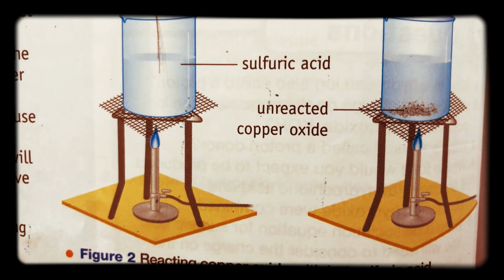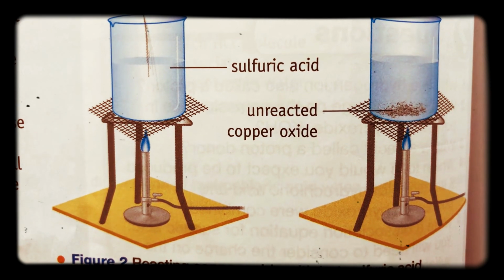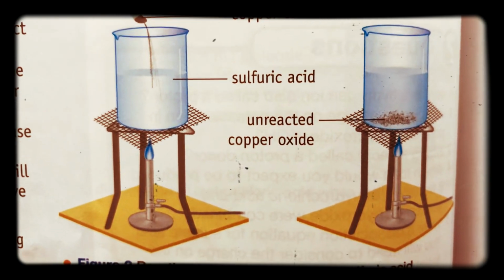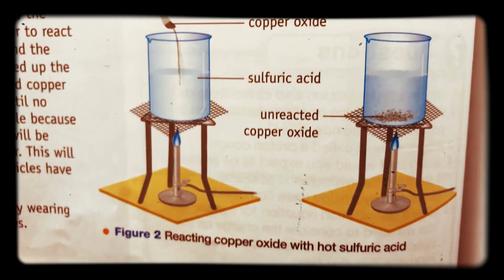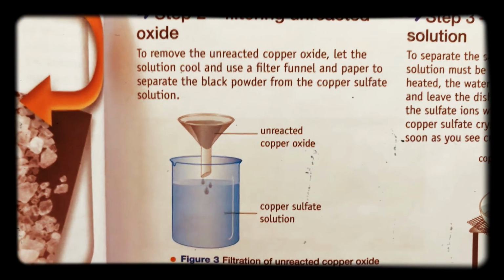And then what we must do as well is we must take care. When we did this reaction, we were wearing safety goggles instead of glasses to make sure that none of that acid popped up through the sides of our glasses. No, we can't wear glasses. Glasses don't provide you the protection. I always say that to students who wear glasses when they do the experiments with me, but now we don't do that. Okay. Step 2 now.